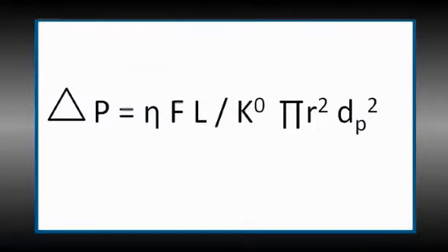When micron-sized particles are packed into a column and liquid is pushed through these particles by your pump, there's a lot of resistance. It's this resistance to flow that causes back pressure. You know, Ron, there are more than a few factors that contribute to system pressure. Yes, John, there are actually 5. Let's look at the pressure equation to quickly understand what affects column back pressure. First of all, there's solvent viscosity.